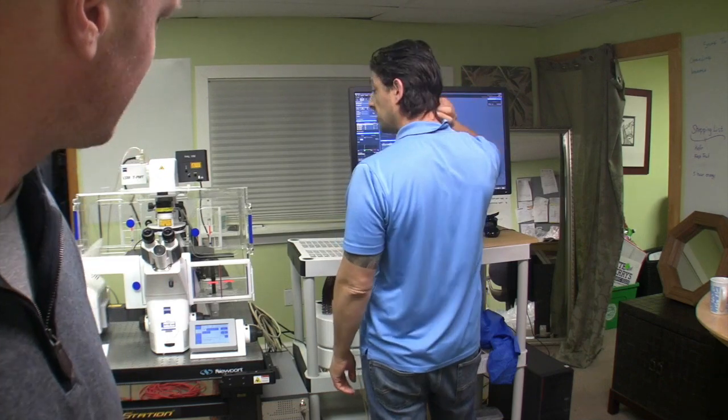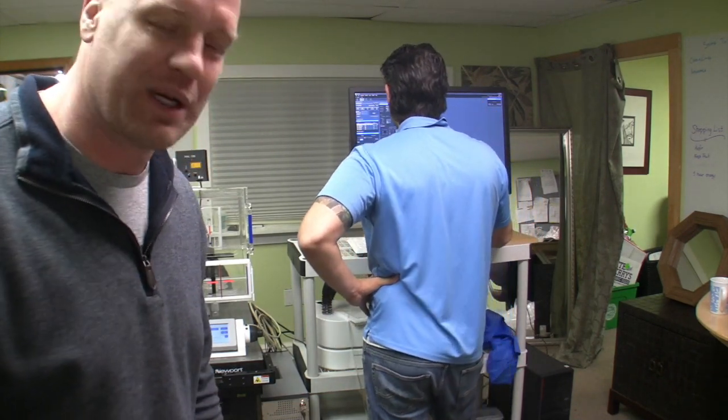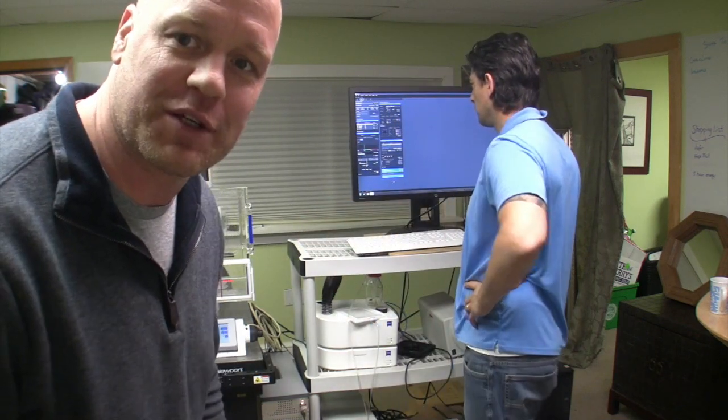We are here putting together this LSM 700. Yeah, Zeiss LSM 700 confocal microscope, and the purpose of this video is to show you that it works.